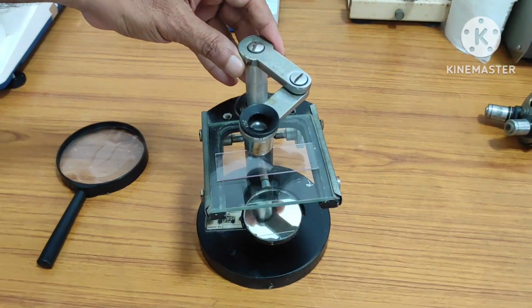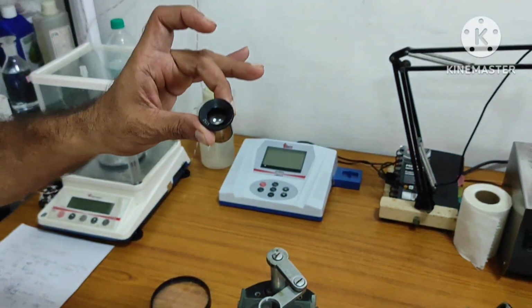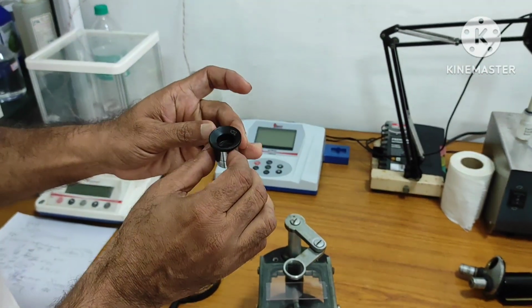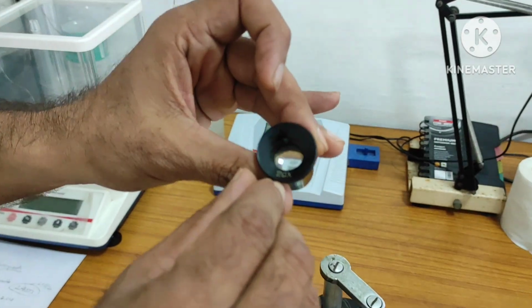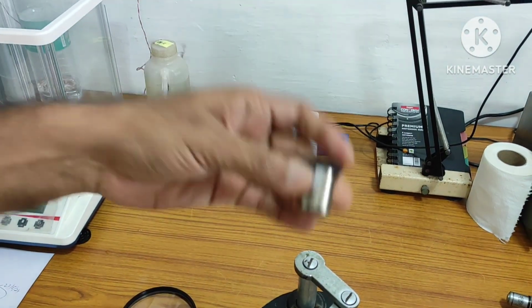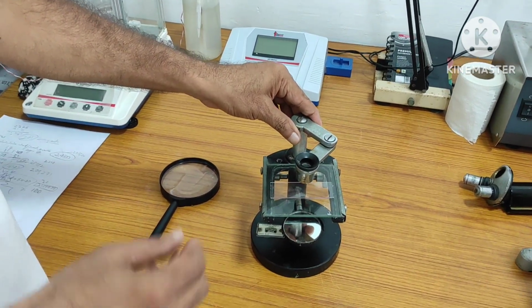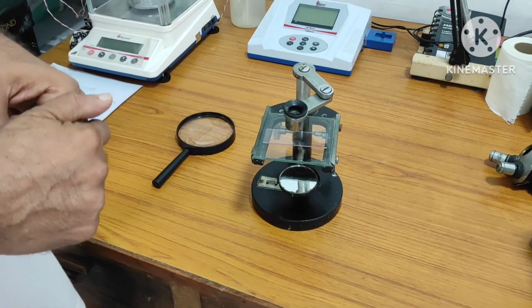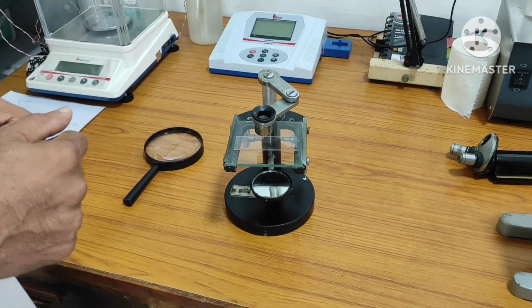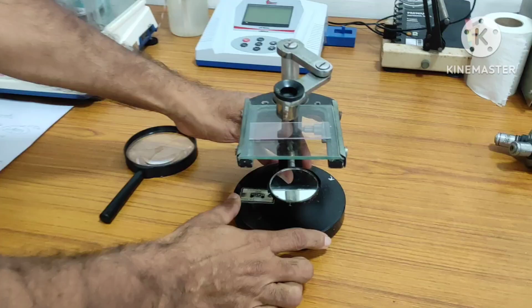Why is it called a simple microscope? Because it has only one lens, that is called the eyepiece, and here you can see it is marked 20x. So it is a small eyepiece, and no other objective lenses are there, only one lens. When we use one lens to observe, to magnify, to enlarge objects, it is called a simple type of microscope.